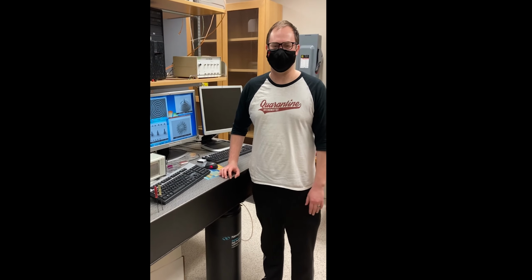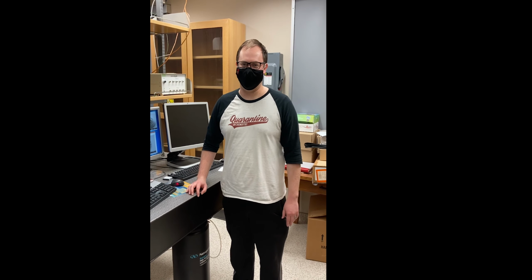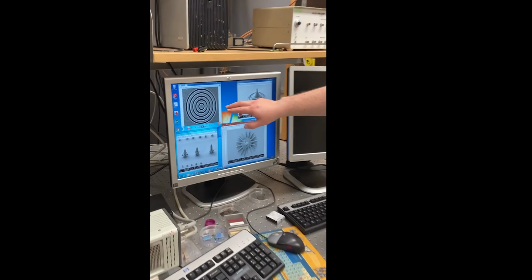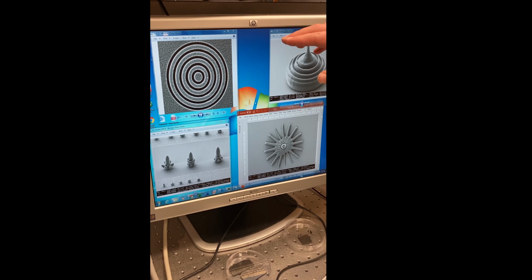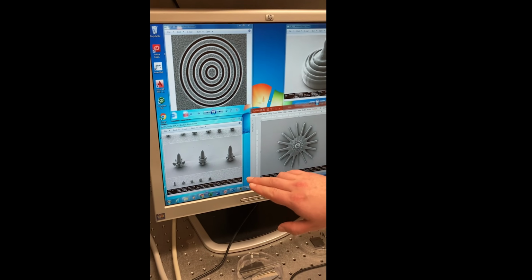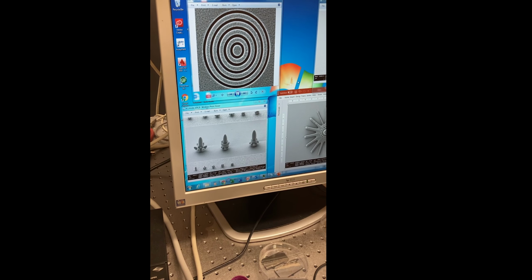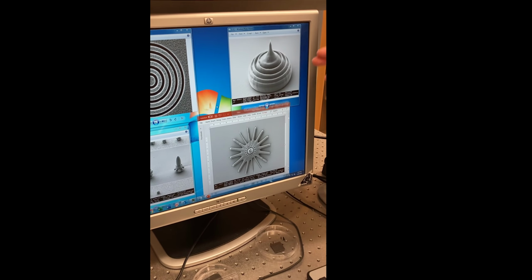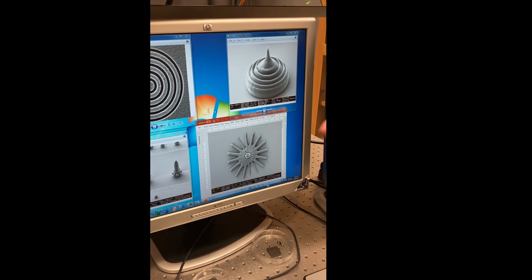I'm Brigham Pope. I'm a second-year graduate student in the Jacobson Group. I'm in the photolithographic mapping project. After we mill nano apertures into thin layers of metal, we illuminate them with UV light to get a 3D model of how the light passes through. We use a negative tone photoresist that lets us see exactly where the UV light has passed through these apertures. By seeing these three-dimensional models, we can determine what uses we can have for these apertures in microfluidic devices.